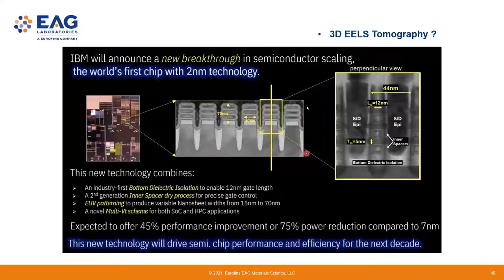Of course, if you tilt it with a large tilt angle to 60 degrees, your sample thickness doubles, which can complicate things a little bit. But in this case your sample is still pretty thin. Think about, for example, 30 nanometers or 20 nanometers of sample thickness; even if doubled, it's only 40 nanometers, still below half lambda, where lambda is the mean free path of electrons, right? So if you have thinner samples, I think a 2D planar sample is probably not a big deal, but I just don't have the data to support my argument here.